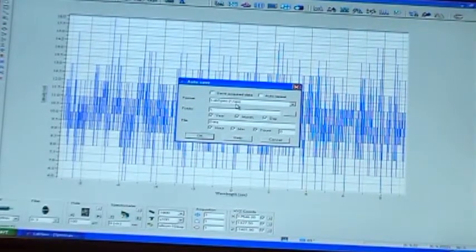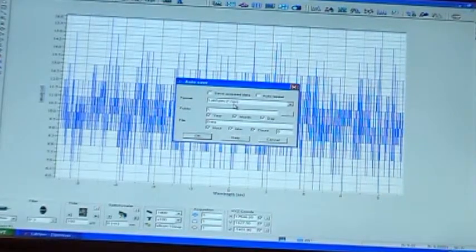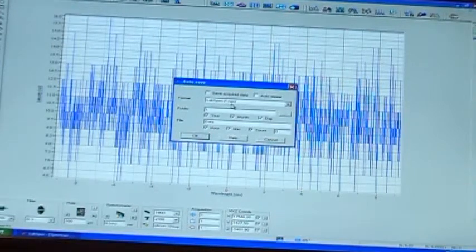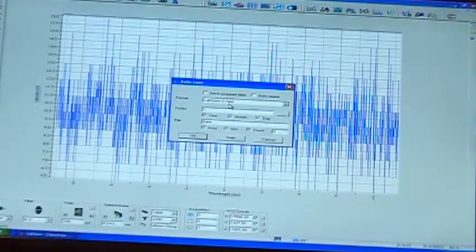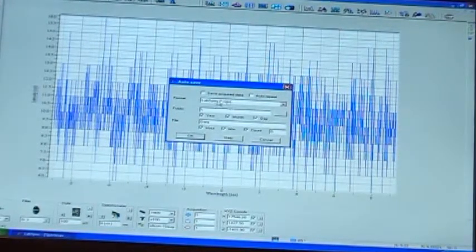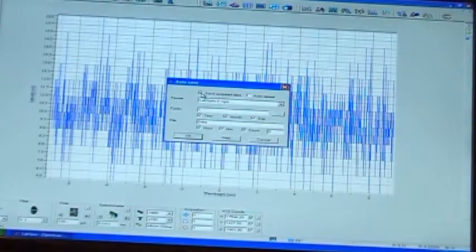That way, if your map's done running at 6 a.m. Sunday morning, and there's a power outage at 8 a.m., you don't have to worry about it. You go, I already know my data got saved. It wasn't wiped out with the power outage. So it is going to save only at the end of the acquisition. Yes. Right here, the little thing, turn it on, save acquired data.